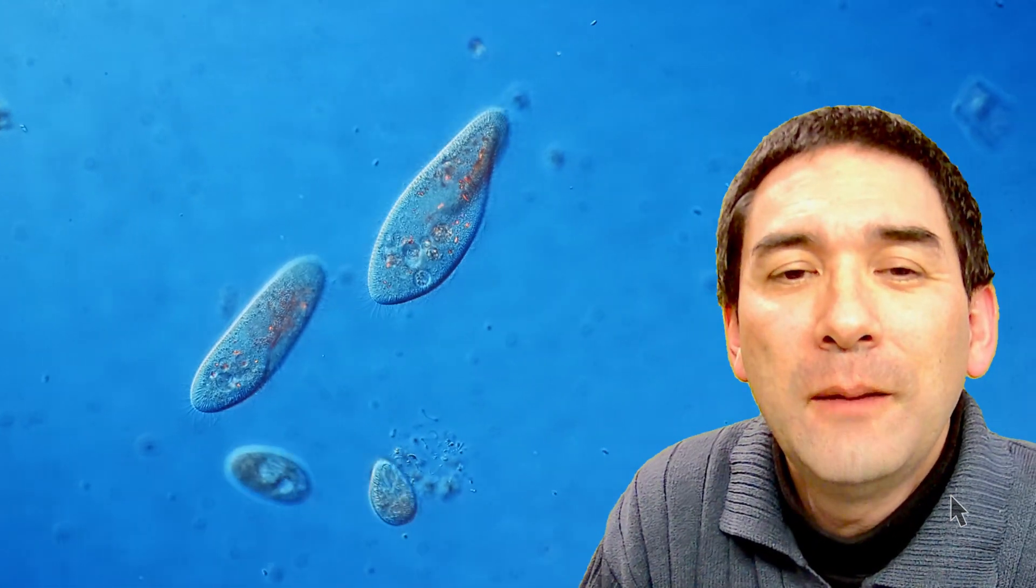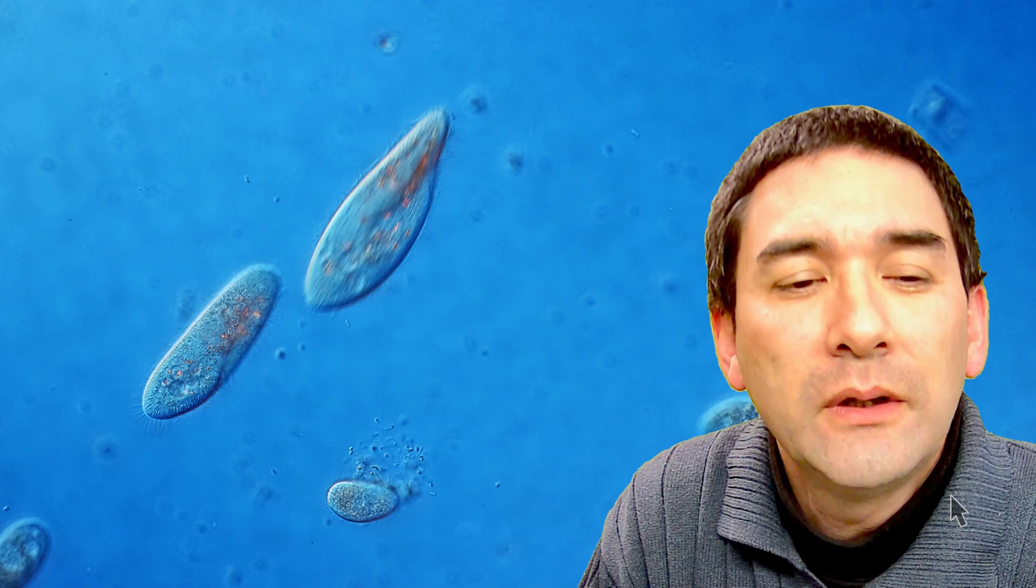Again, two paramecia over here. And if you look very carefully, this is not a very good place to stop, but at least here in the lower one you can see that there are sometimes those little circles in there, those larger circles.